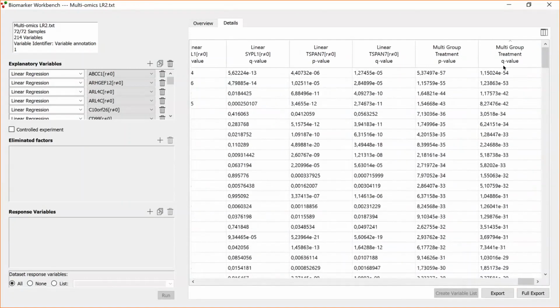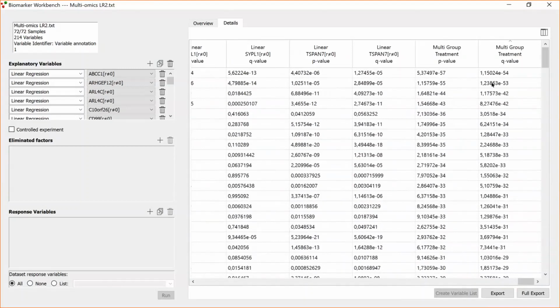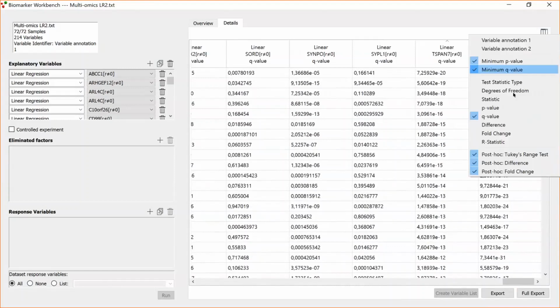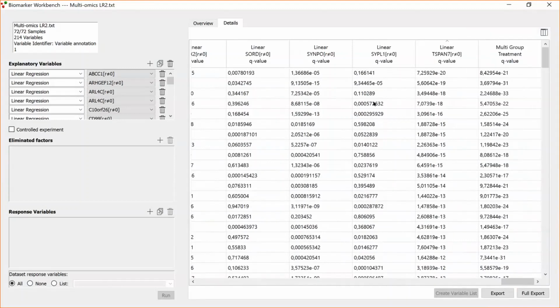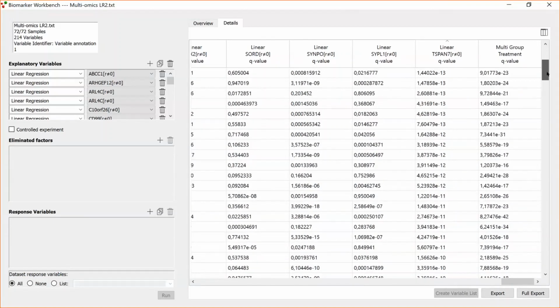You can click on each of them to sort the variables and then make a list out of these. So for each of these, you can do that. And you can configure the view here so that we take away some of the columns here, maybe like that. So we show less. So you can click on each of these and find which are the most interesting variables here.